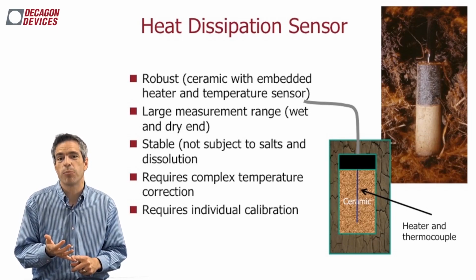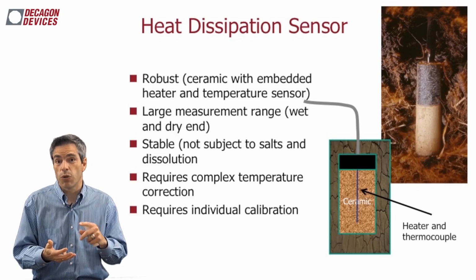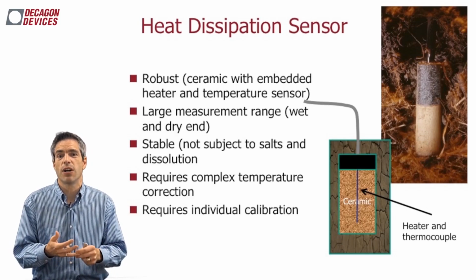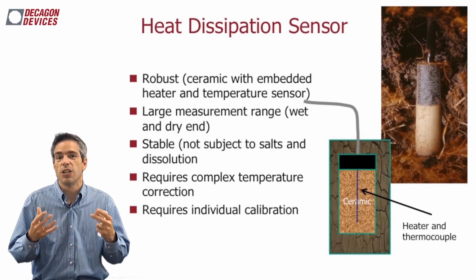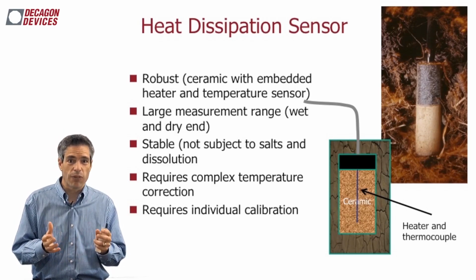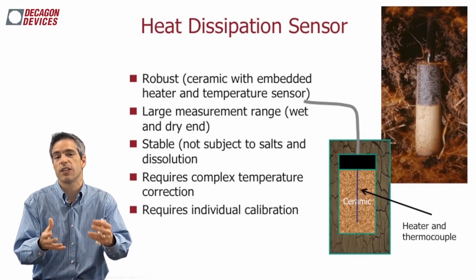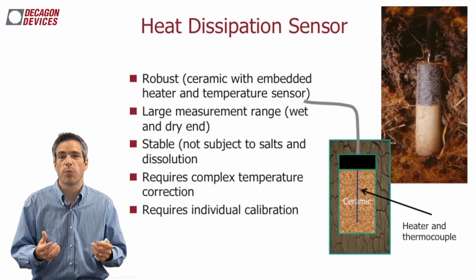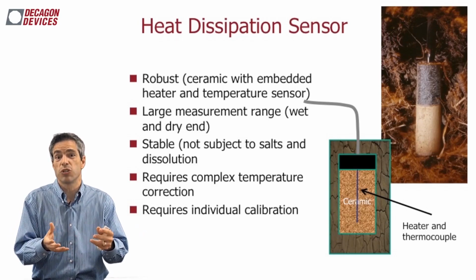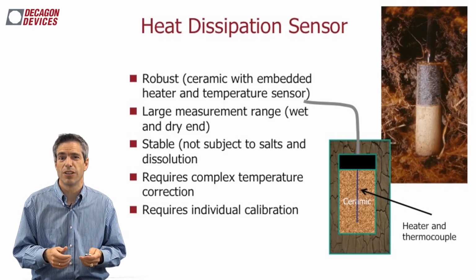First of all, it takes a complex temperature calibration, and according to the papers that are out there, to buy these sensors you need an individual sensor calibration. But never fear, if that's not something you want to take care of, not something you want to do as a part of your research, there are companies that actually do this calibration for you. So that is a possibility.